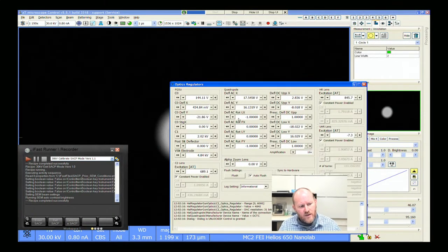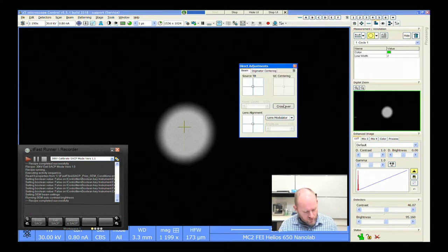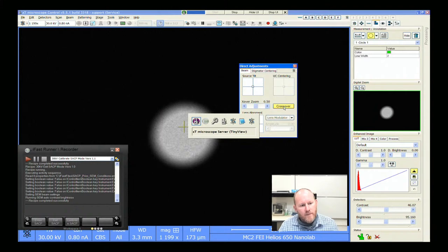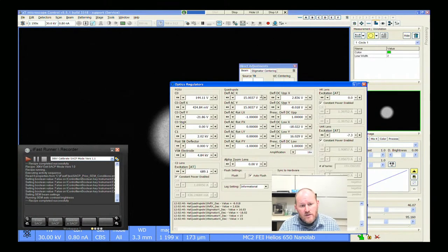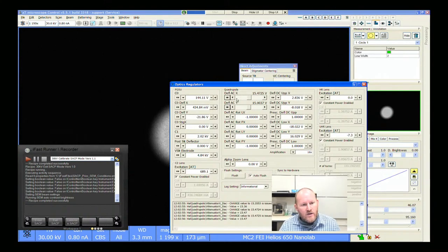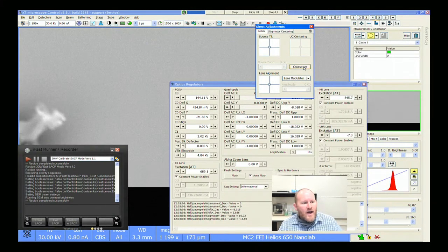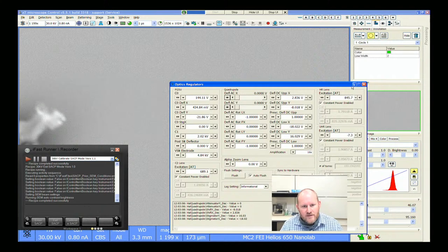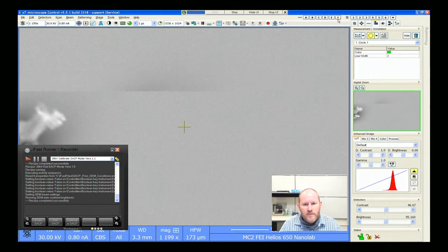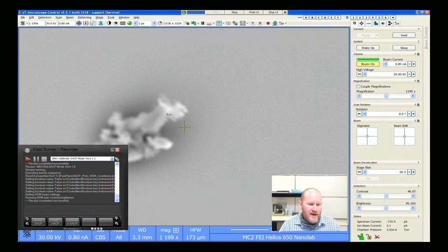These didn't reset when I said exit SACP because I was in this weird hybrid manual mode, but I can just come in and turn the crossover mode on. One thing that you can do is get used to what happens when you go into crossover mode. If you look at these optics regulators, you really start to learn your electron column. What it does is it's scanning the electron beam here with the deflection AC. If I go out of crossover mode, I expect these to go back to zero — and they did. So now effectively we've utilized some functions on the Helios to get back to a standard imaging condition.